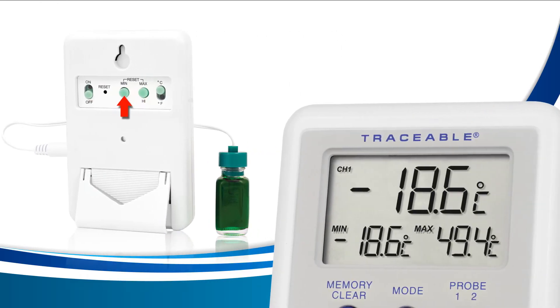Pressing the min button will clear the min memory only, and pressing the max button will clear the max memory only.